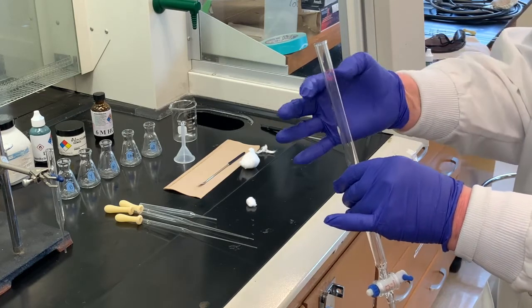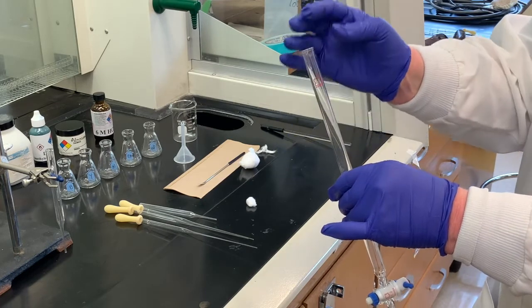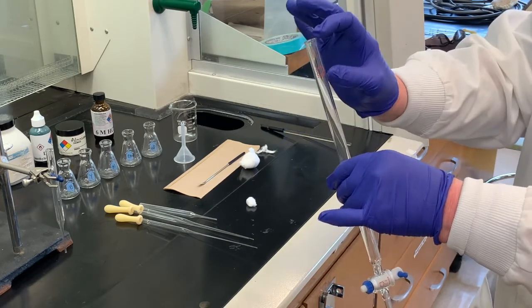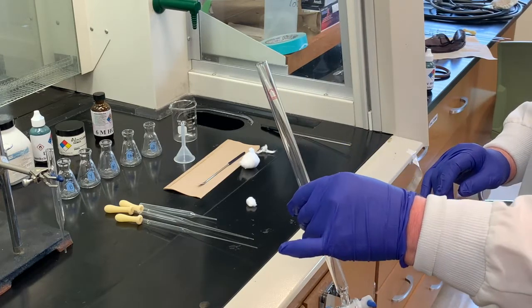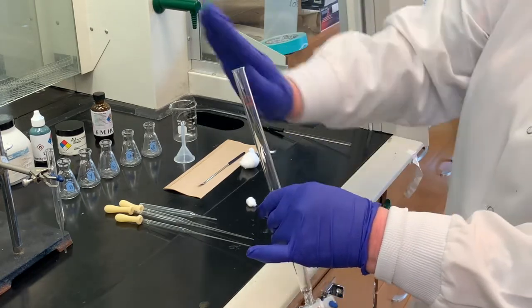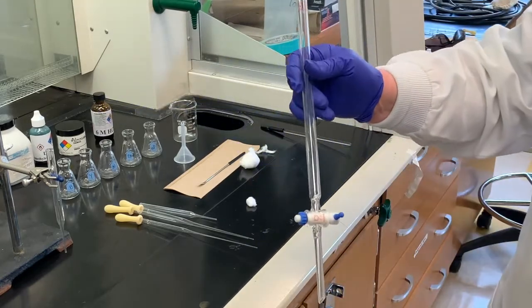And right at the top of the sand is where we'll add a drop or two of our sample to be separated. Let that drain a little bit, and then we'll fill the rest of it up with whatever solvent we're using for that separation. So we're going to do the same process here. This is just going to be a little bit smaller and quicker to get the experiment done.